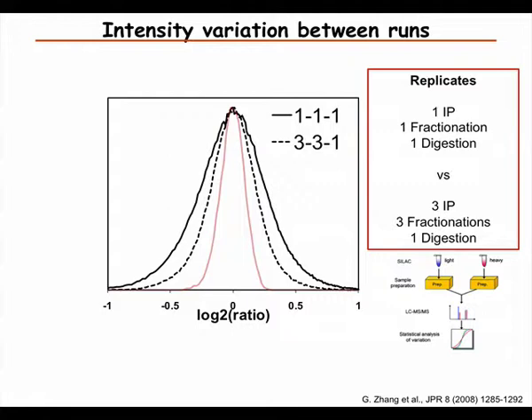For the top selected, the ones that are most abundant. The proteins that are selected at the top, yeah, the most abundant. Detected proteins detected by two methods, they're similar. Yeah, they're pretty similar. I mean, it depends on. If they're done in the same lab with the same instrumentation, they're usually quite similar.